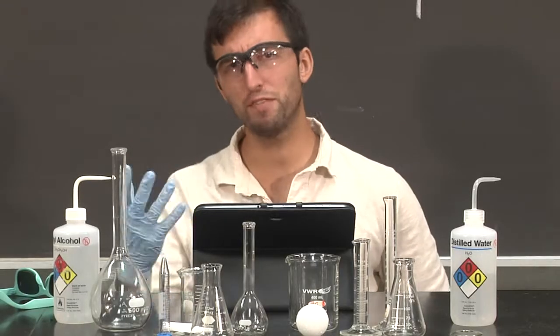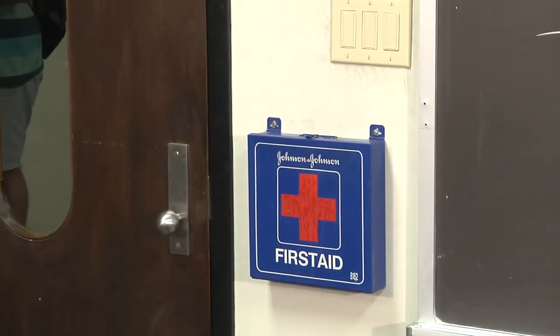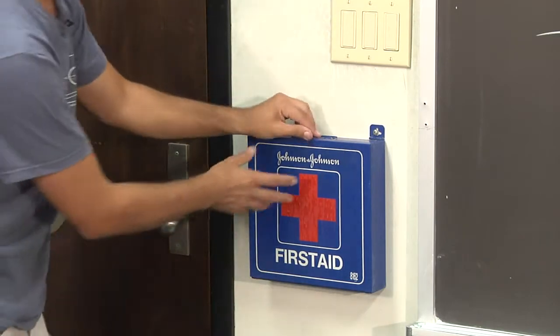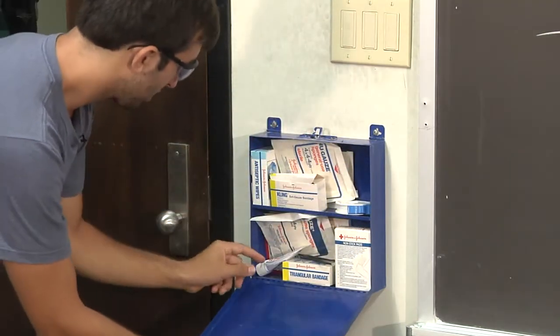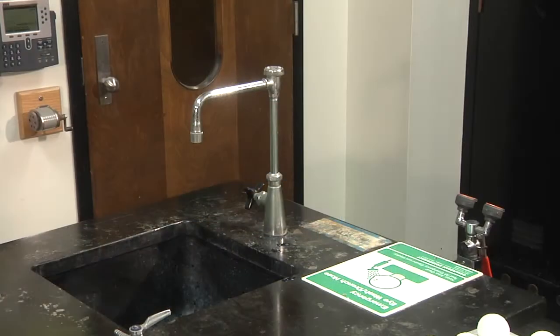Be familiar with the location of safety equipment. The first aid kit is typically found by the door. Inside of it you will find bandages, band-aids, gauze, hydrocortisone cream, scissors, and a lot of other good stuff.